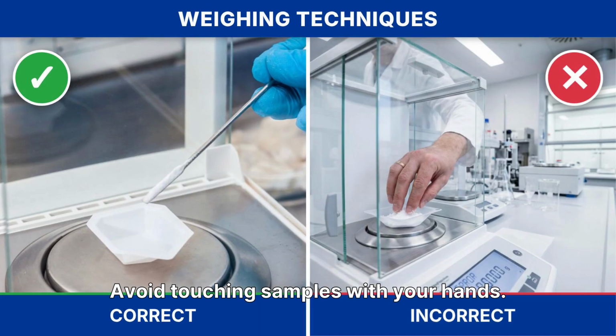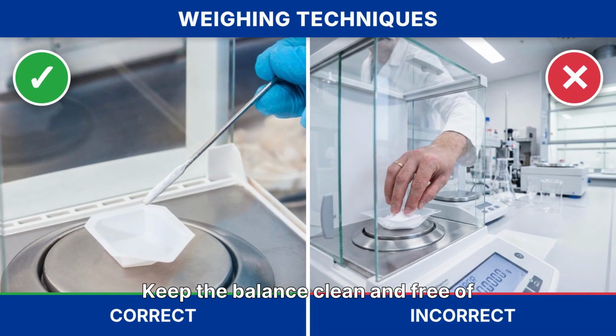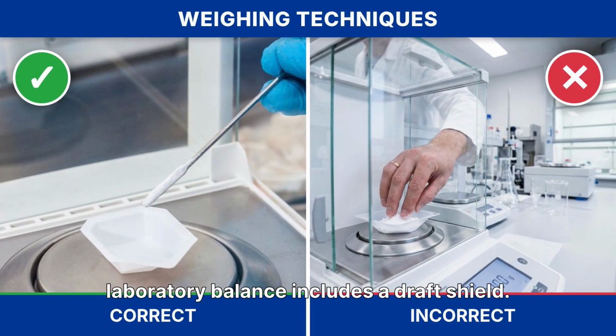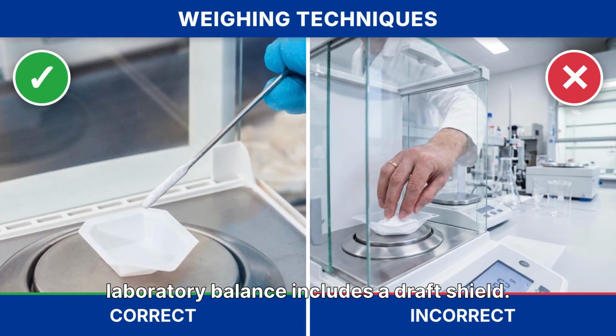Avoid touching samples with your hands. Keep the balance clean and free of spilled chemicals. Always close the balance doors if your laboratory balance includes a draft shield.